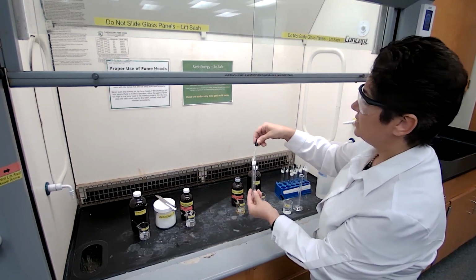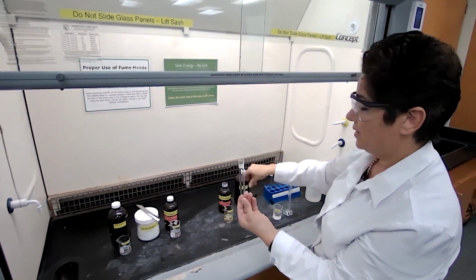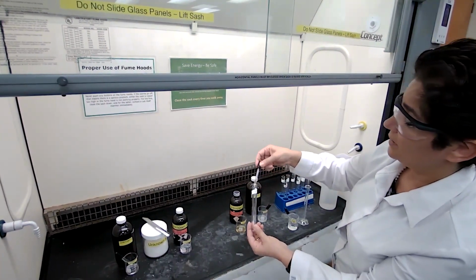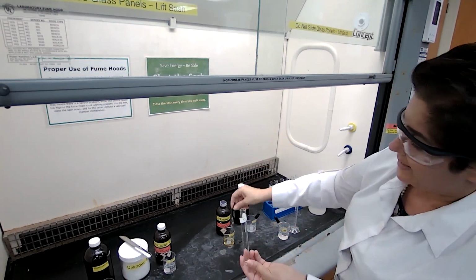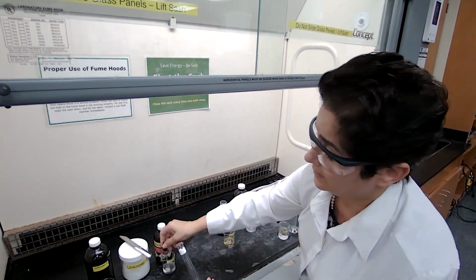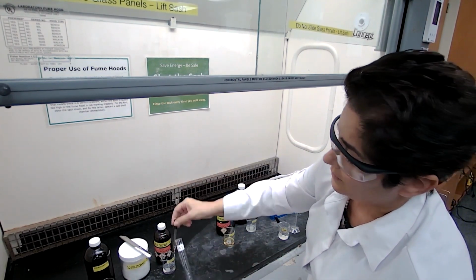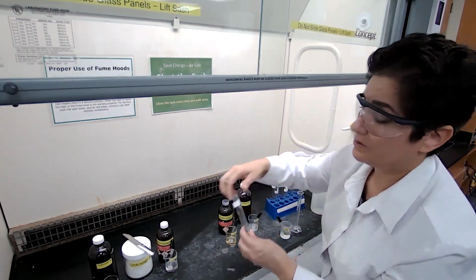I'm going to add 1, 2, and 3 drops of unknown 1. Unknown 2, I'm going to add 3 drops of unknown 2 into test tube 2, and so on. I have unknown 4, which is right here. 3 drops of unknown 4. These are the liquid unknowns. And unknown 6 is liquid.